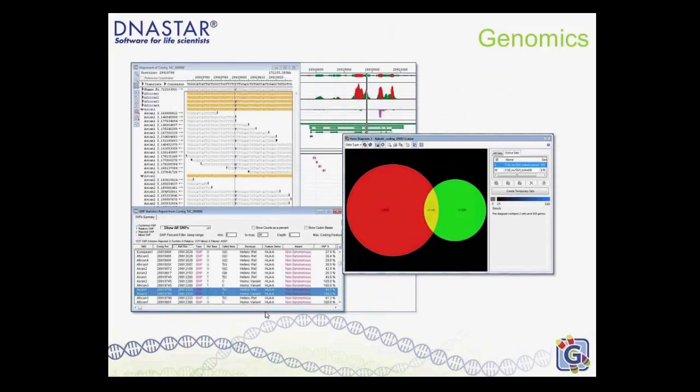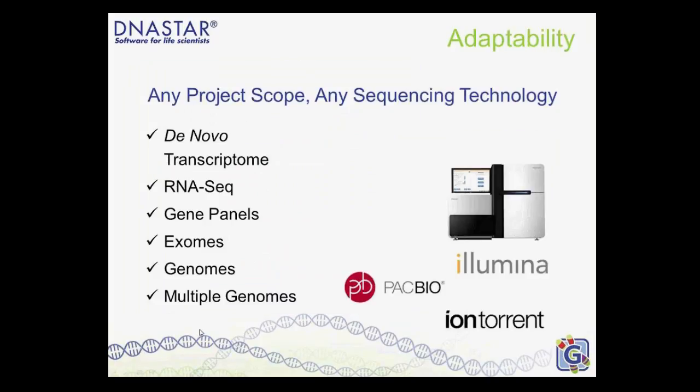So some really nice new developments there. And genomics is where I want to focus today. I've had several webinars in the last couple of years on all different topics, and today we're going to really focus again on transcriptomics. There are multiple different programs here that offer different capabilities, and we're going to dig in a little deeper into our ArrayStar program that is used for analyzing gene expression.